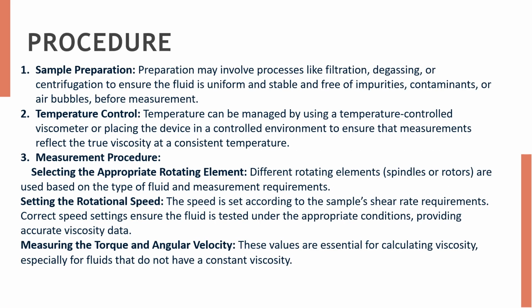Now we will see the general procedure on how to use a rotational viscometer. First is sample preparation. Before using any kind of instrument, we have to make sure that the sample we are using is free from impurities, contaminants or air bubbles. To make sure that it doesn't contain any kind of impurities, we will put the sample through processes like filtration, degassing or centrifugation, so that we can obtain a sample which is uniform and stable.